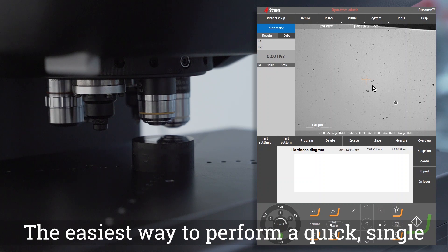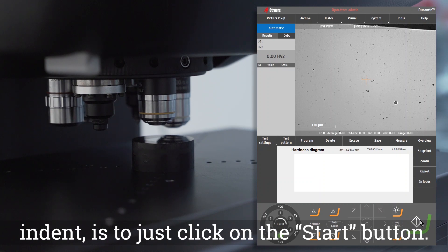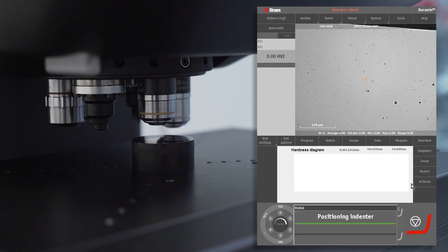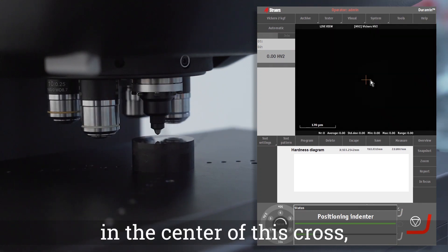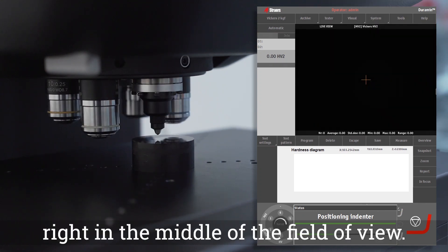The easiest way to perform a quick single indent is to just click on the start button. An indent will be made in the center of this cross, right in the middle of the field of view.